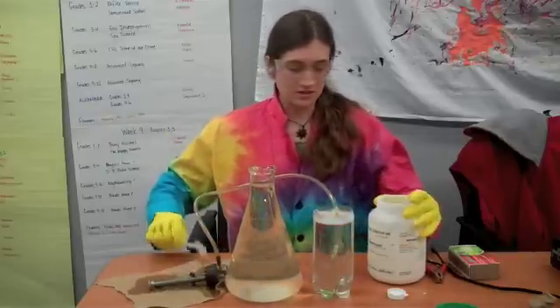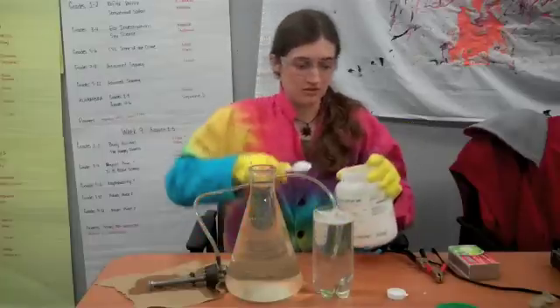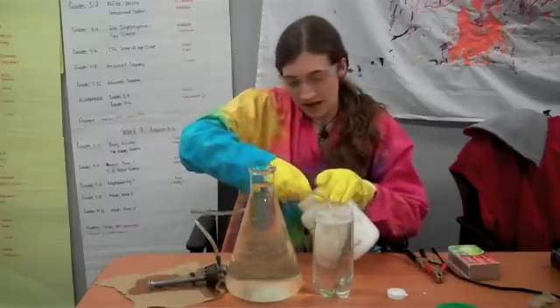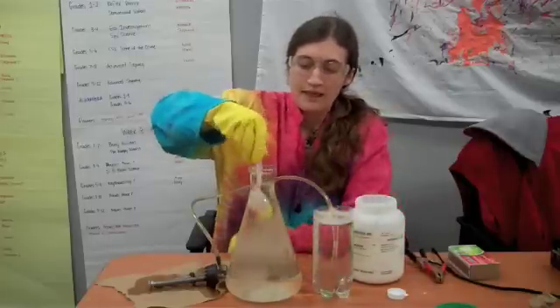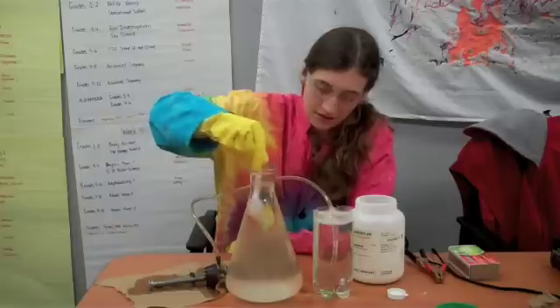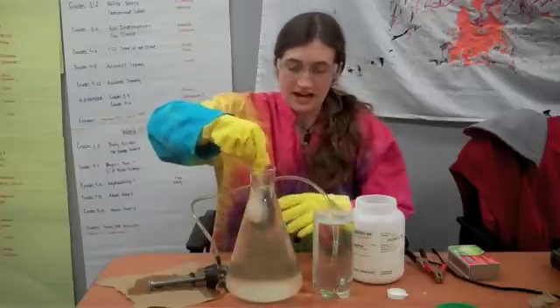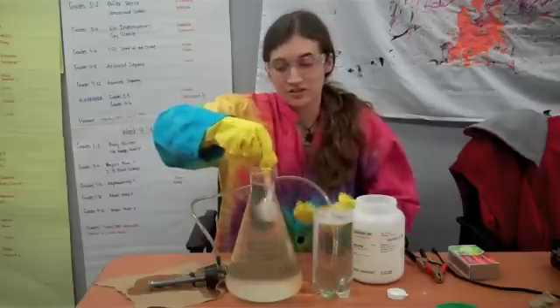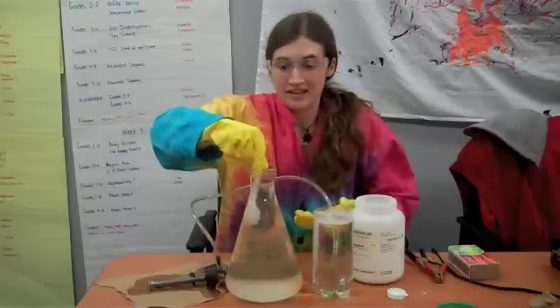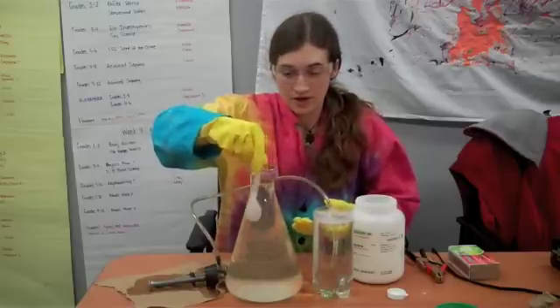I'm going to take this special salt, which is sodium sulfate. I already added some, and I'm going to add a bit more into it. As I'm stringing this up here, what happens is the salt breaks down into ions — atoms that have a positive or a negative charge. Since they have an electrical charge, they're able to carry electricity, unlike pure water.